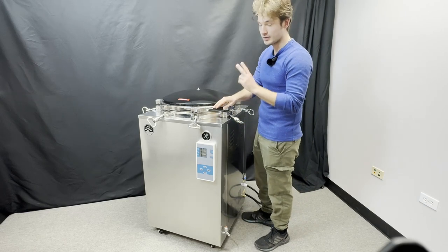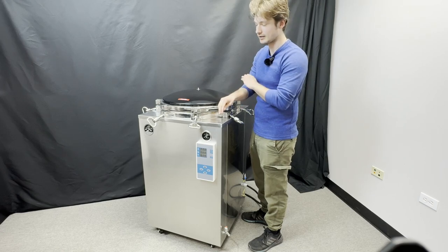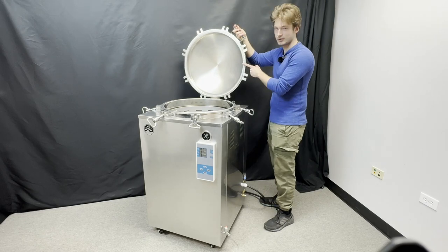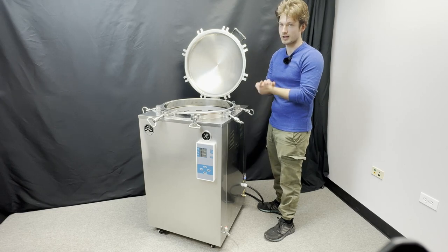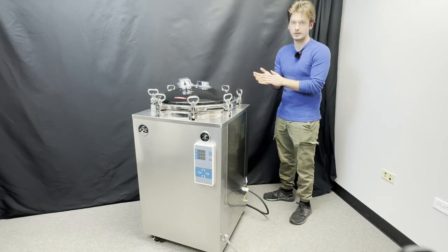These 150-liter autoclaves come standard with 304 stainless steel as well as high-quality electronics. We've run these systems twice a day, every day for the last three years, and the only thing we've ever had to replace is the silicone gasket. However, we do offer a full lineup of replacement parts if needed, and they're all covered under our 18-month warranty.